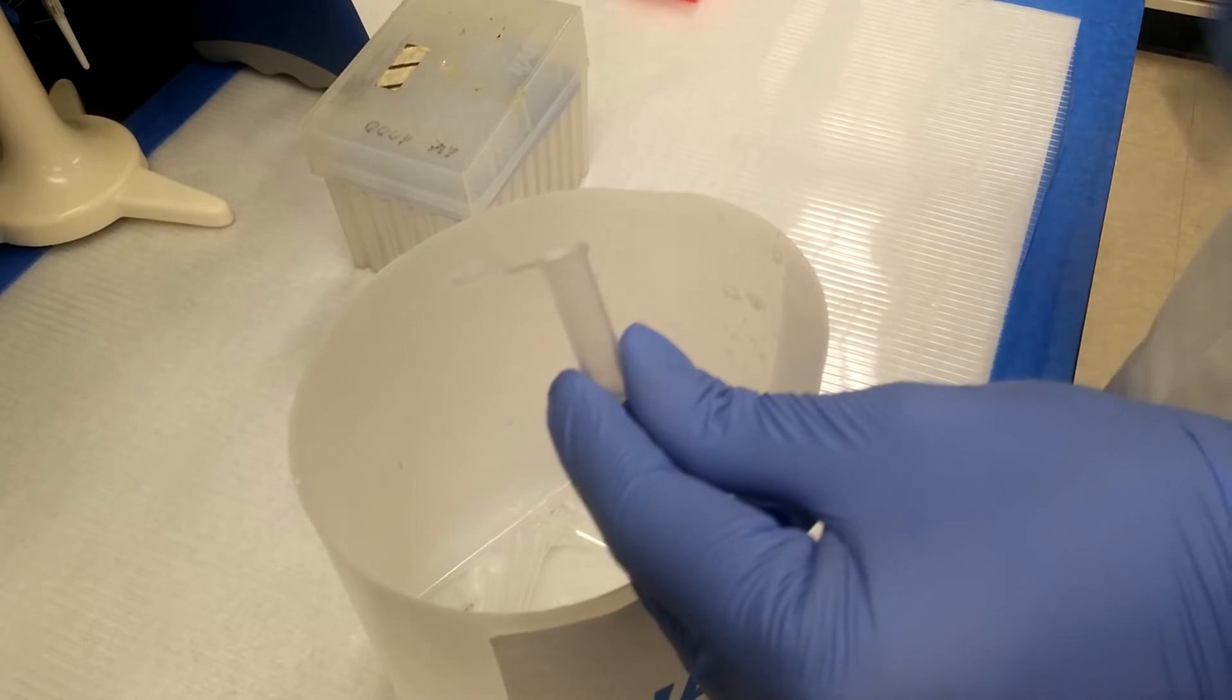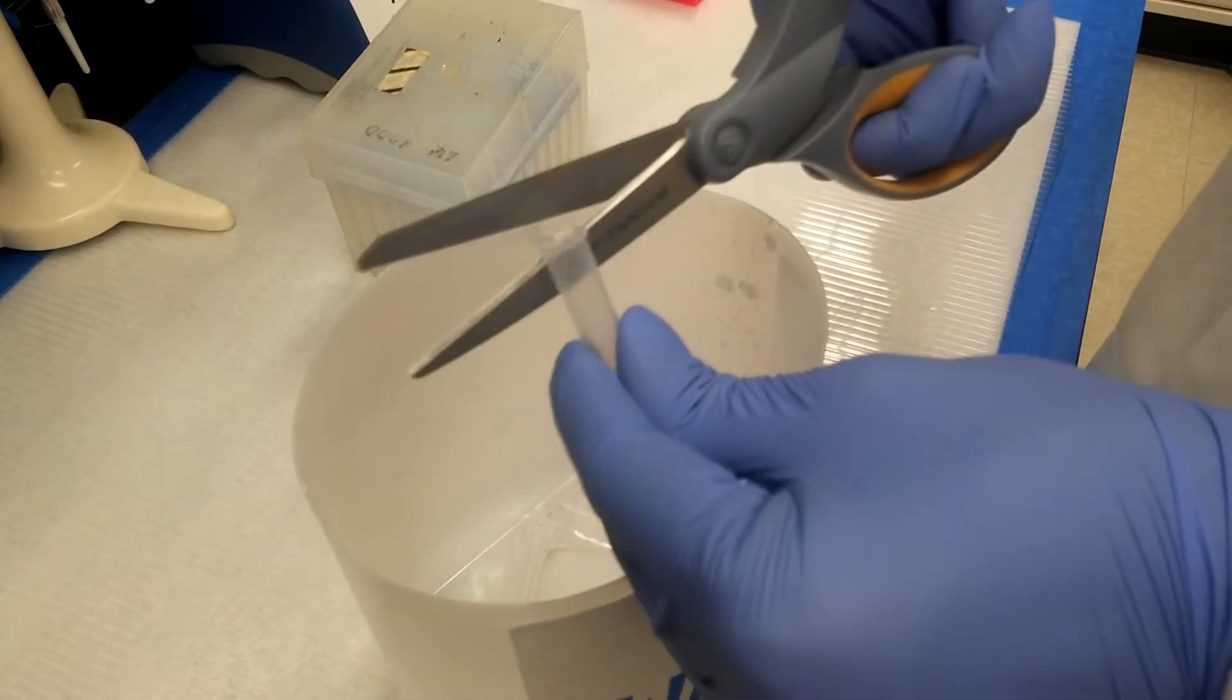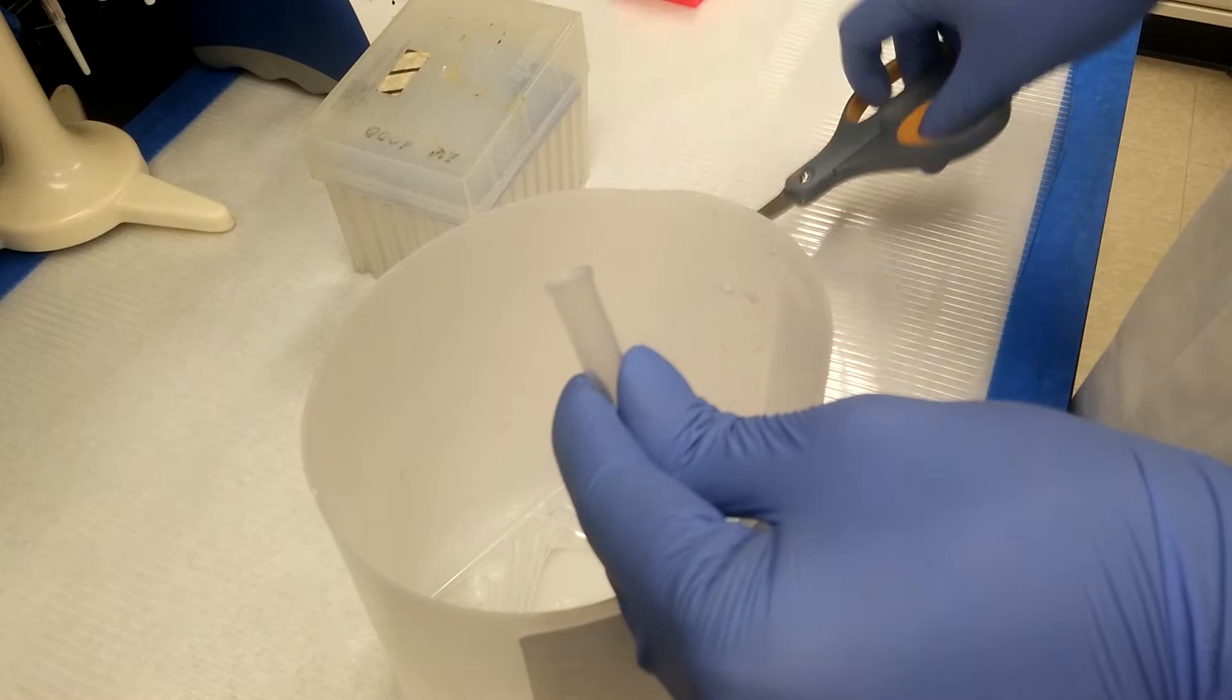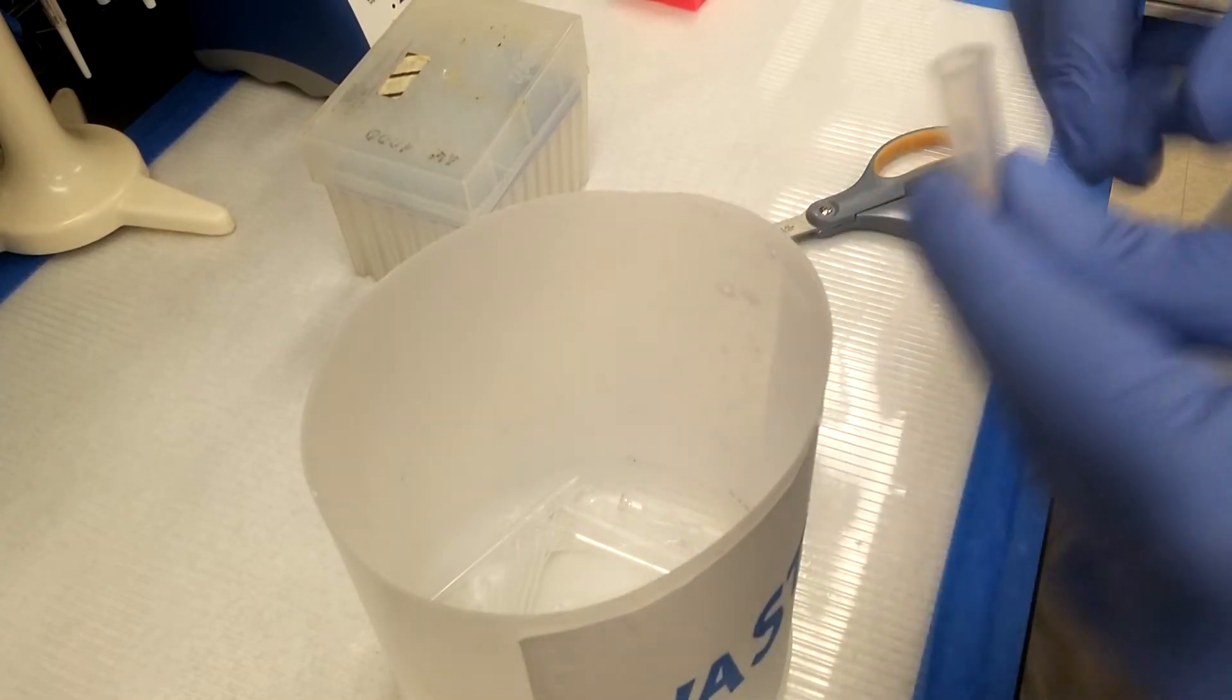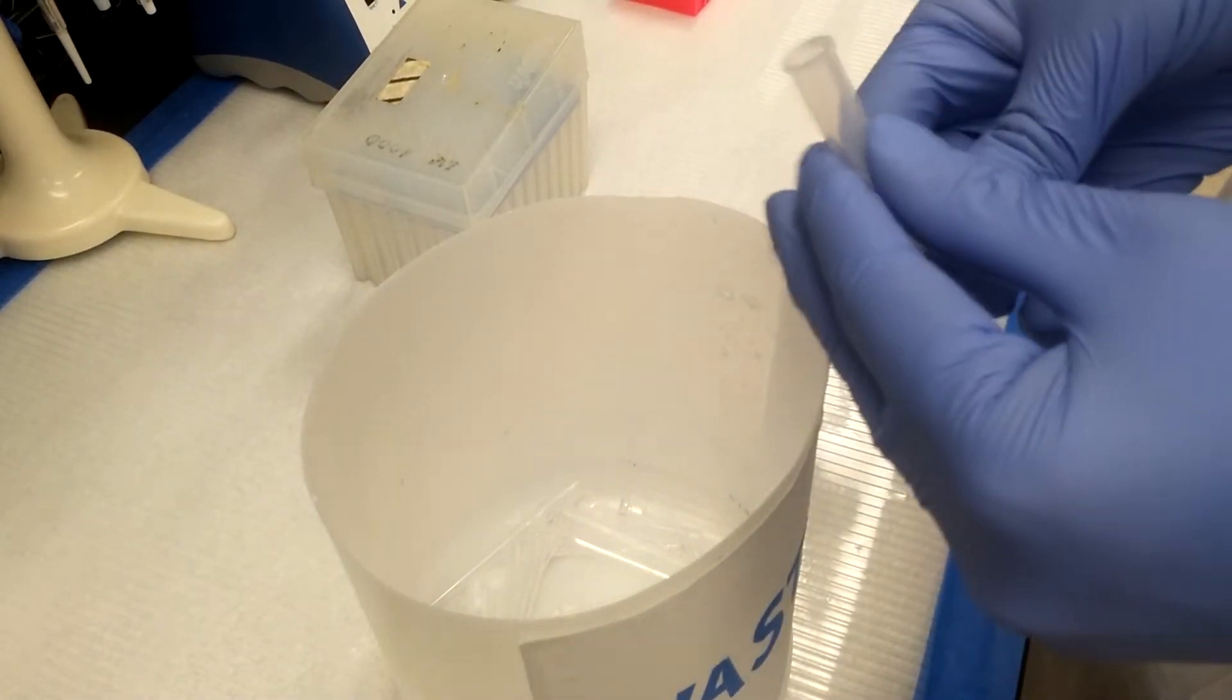8 more 2 milliliter tubes are prepared by cutting off the lid from each of them. The lids can then be discarded. These tubes will be used as collection columns.